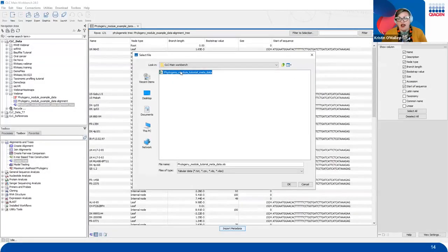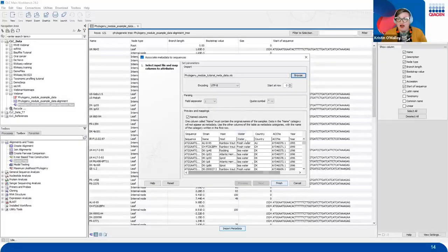And you'll see here I have an Excel spreadsheet that again is just a list of the sample identifiers and a whole bunch of different columns of other different metadata points here. So I'm going to go ahead and click on the OK button right here to grab that specific metadata file. And you'll notice that we have a preview down here.